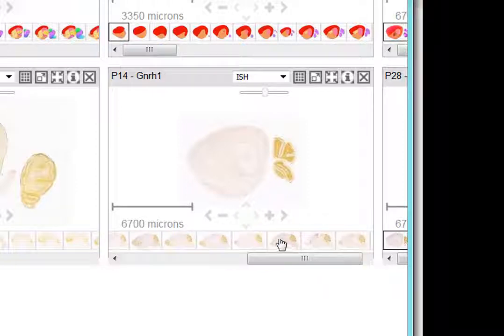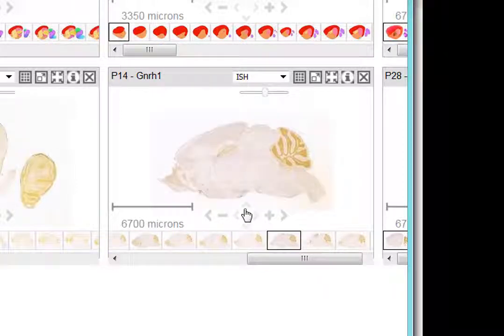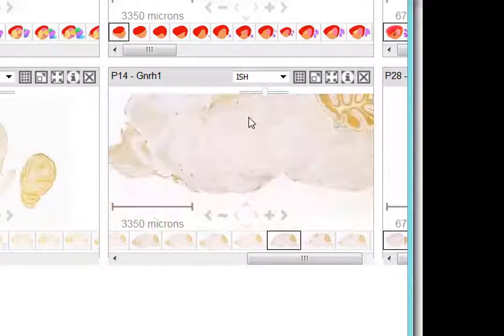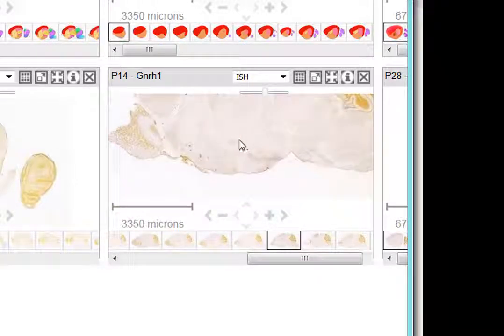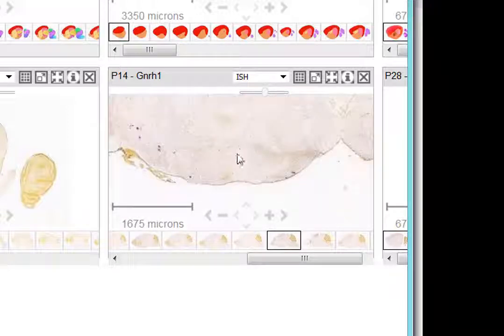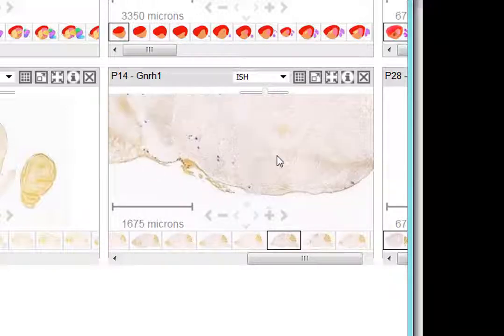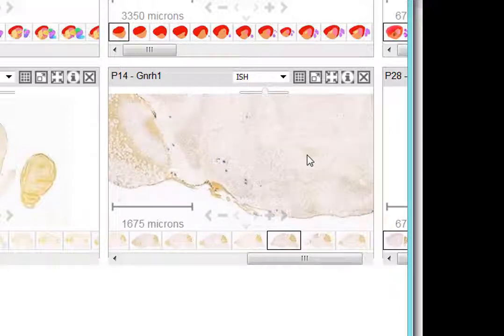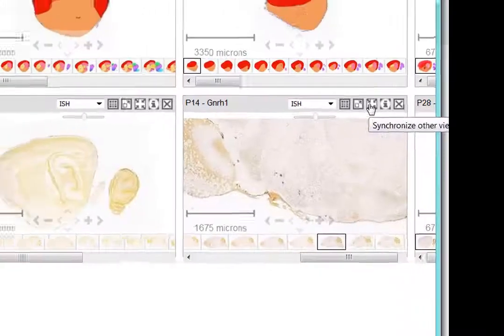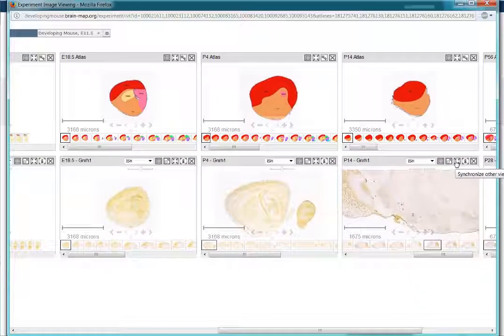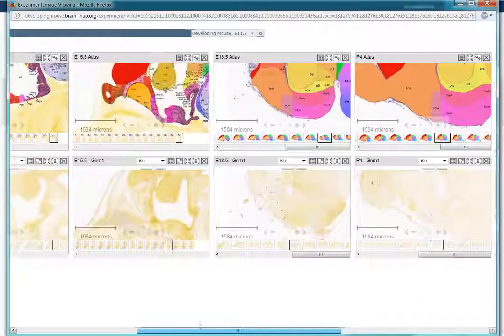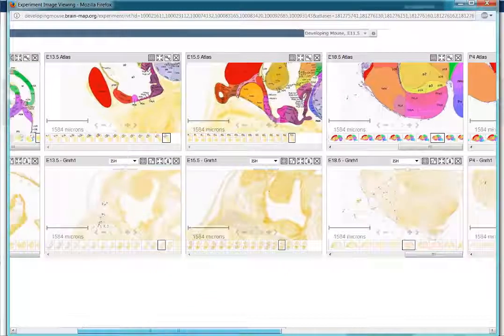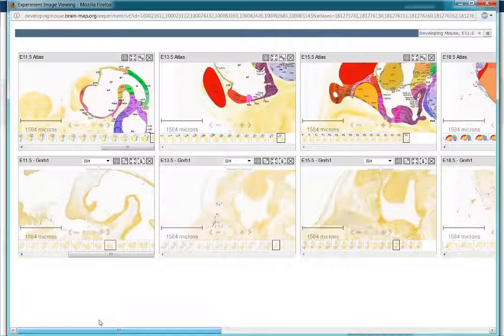And in this instance, clicking the Sync icon once you've found a region will sync all the experiments to that location. In the developing mouse brain resource, that also means syncing to that location in time.